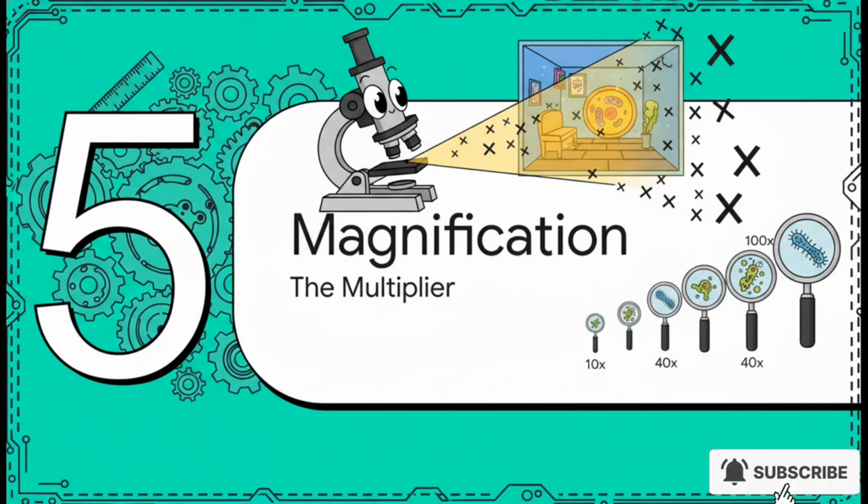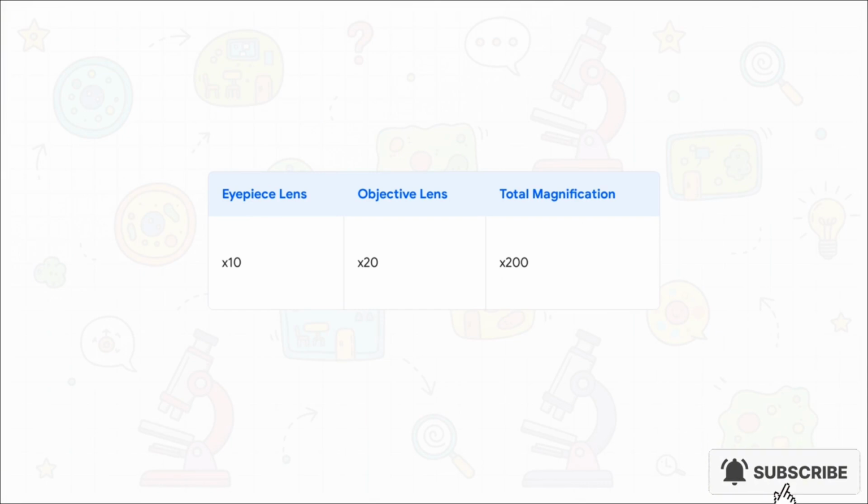Which brings us to part 5, the magnification multiplier. Figuring out how much you're actually magnifying an object is beautifully simple. To find the total magnification, you literally just multiply the eyepiece lens by the objective lens. So for example, if your eyepiece magnifies by 10 times and your objective lens magnifies by 20 times, well, 10 times 20 gives you a total magnification of 200, meaning you are seeing the object 200 times larger than real life. It's really that easy.